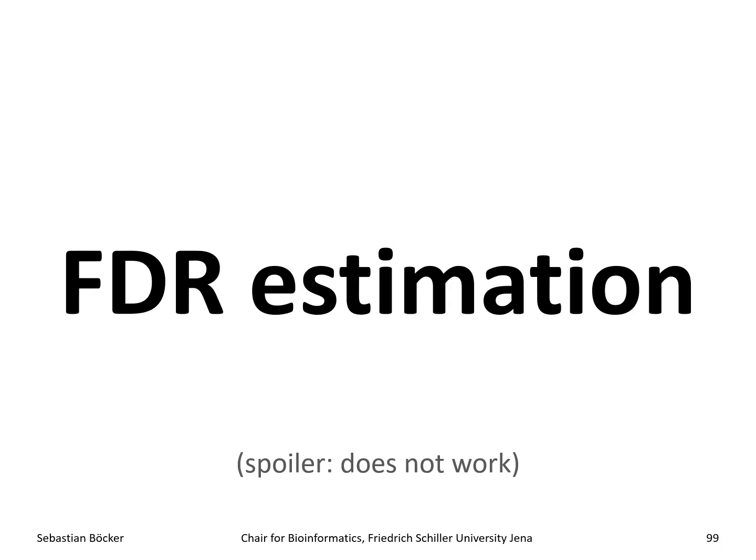Okay, now we come to the very last point, FDR estimation. I told you, so far everything I have talked about when I talked about FDR were exact FDRs, nothing estimated. And when I talk about FDR estimation here, I can only tell you it doesn't work. And I'm convinced that this has nothing to do with our inability to do FDR estimation. I'm convinced that this is because it will be impossible for small molecule mass spectrometry annotations. But if you're not interested, this is more or less a negative result. You can completely forget about it. If not, be my guest to hear why I think it's impossible and what we actually did.